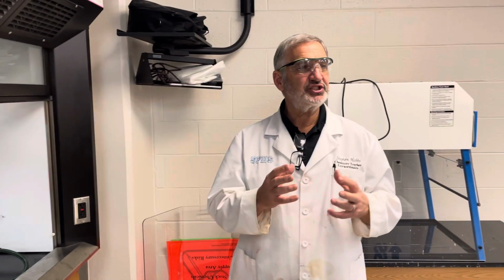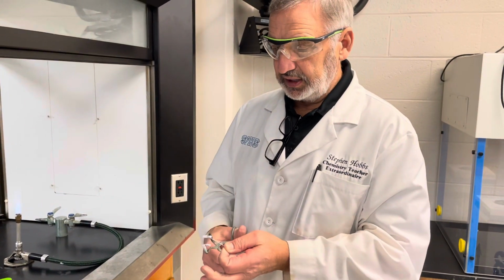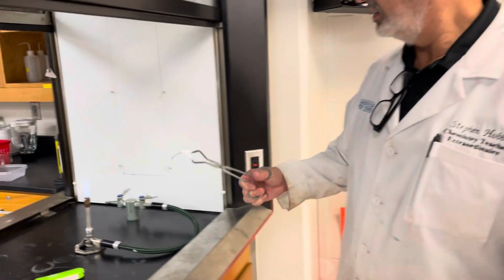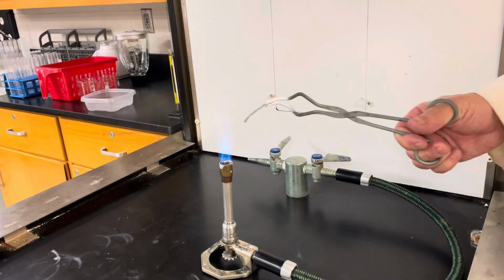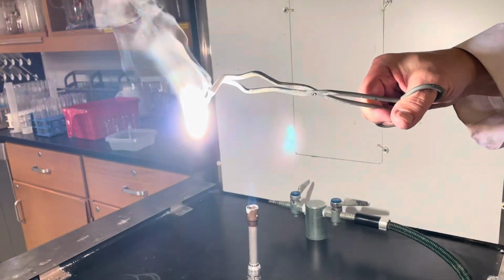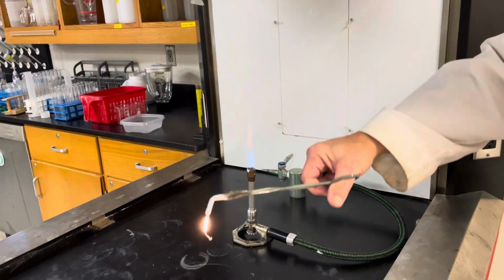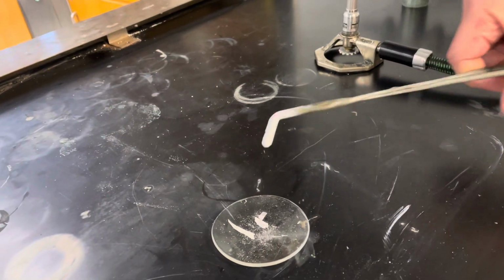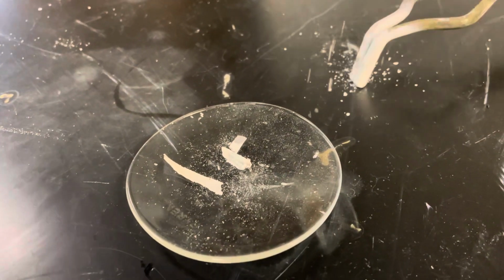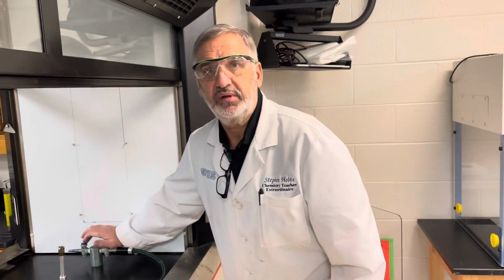So looking at your reaction sheet, the first type of reaction is going to be a reaction of magnesium. We're going to take some magnesium metal and we're going to just take it here in the hood, and remember that the hottest part of the flame is that interior blue cone, so we're just going to put it into here, and you can see that it's burning a very bright white, giving off a lot of heat. Okay, and then we tap it and we can see that we have a white ash formed as a result of that combustion reaction.